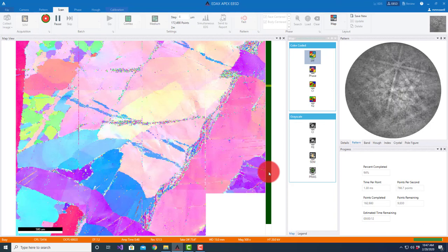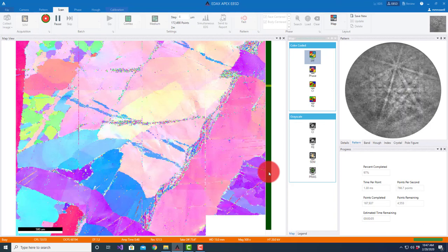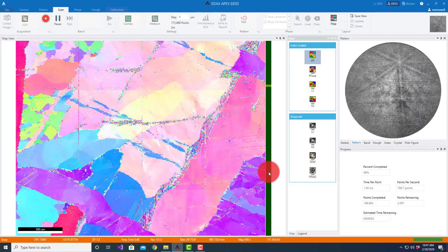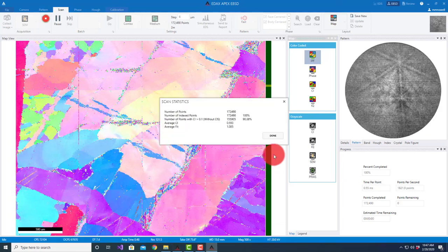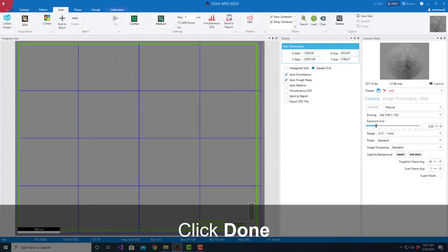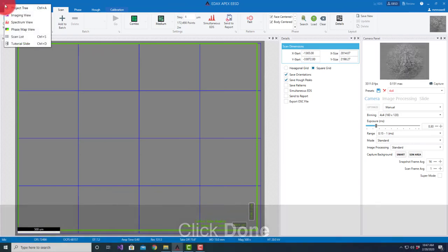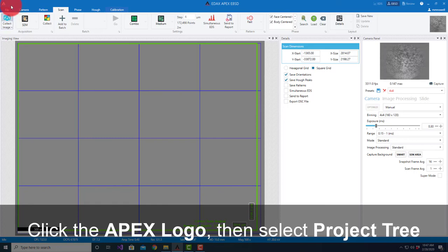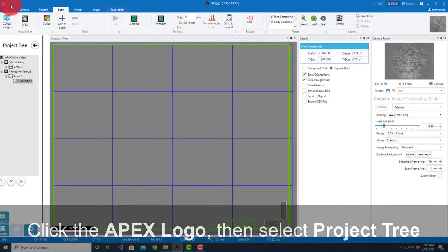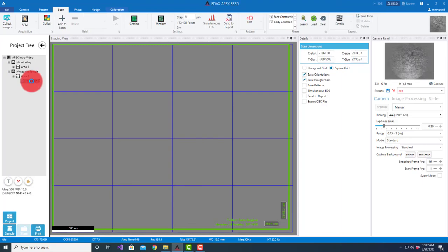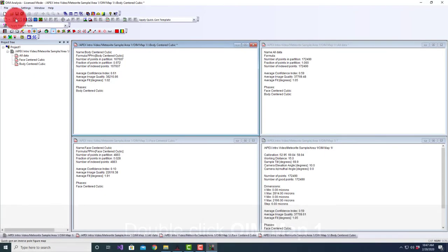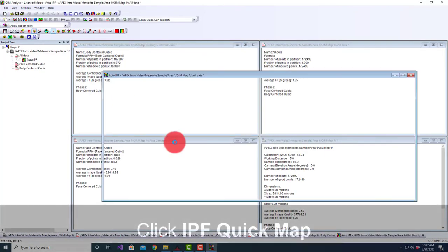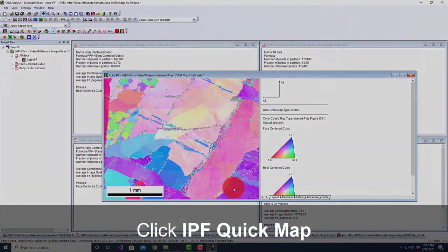It's now finished. It's now going to automatically seam this together, stitch it together, and create a data file in the HDF5 file. I can go ahead and hit done here. I'm going to look at our project tree. There's my meteorite sample one. I double click this and it's going to start OIM analysis. Our single file here is now completely stitched together and ready for analysis.